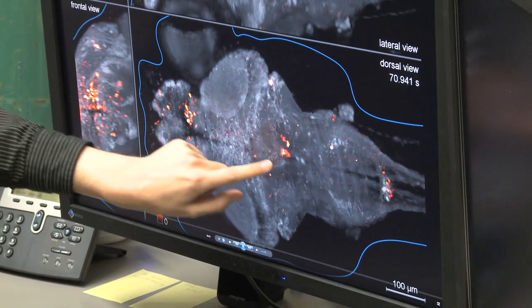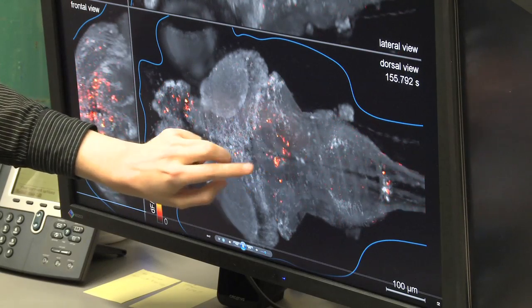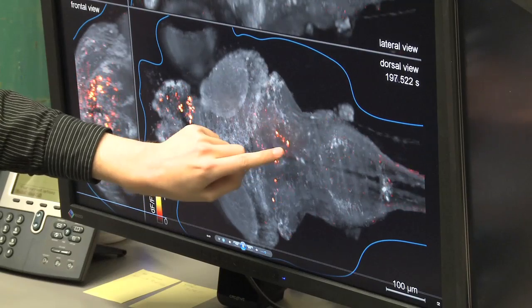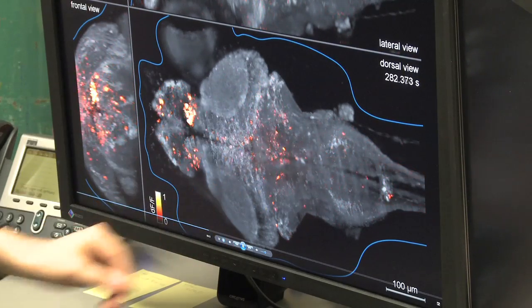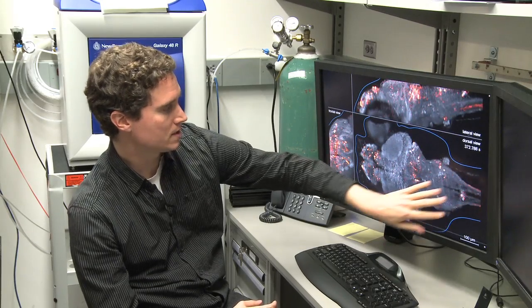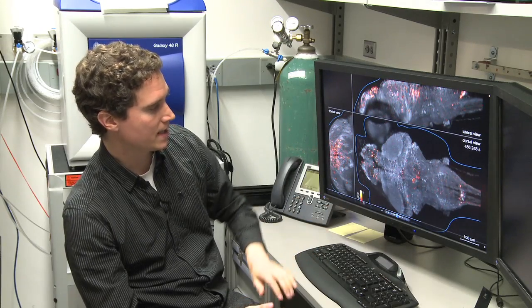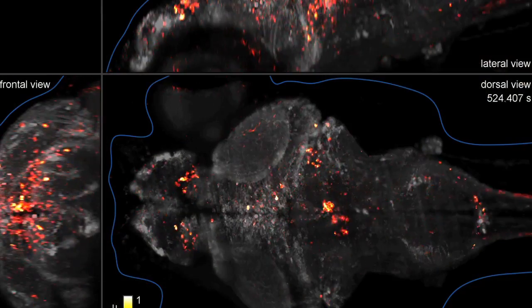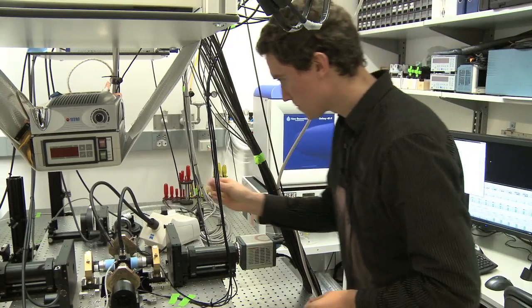There's a structure that we found here that we call the hindbrain oscillator, where there are two groups of cells basically alternating. They're never quite on at the same time, so sort of in perfect antiphase. There's also a pattern here in the spinal cord that is linked to the activity that we see here in the hindbrain. And overall, these are fairly complex patterns, and this is exactly one of the reasons why we want to do this whole brain imaging experiment.